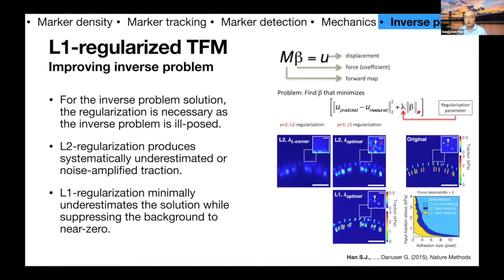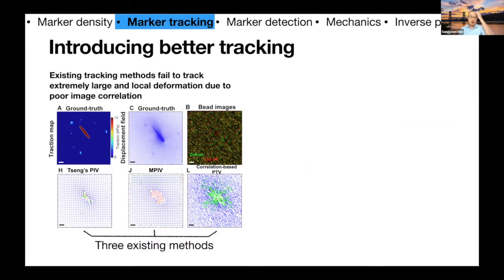Using this L1 regularization, we can detect forces that have lower magnitude and smaller size, so that in the yellow area we can get more. So that was the contribution. And also, after coming here, we tried to make improvements to the tracking part of traction force microscopy.